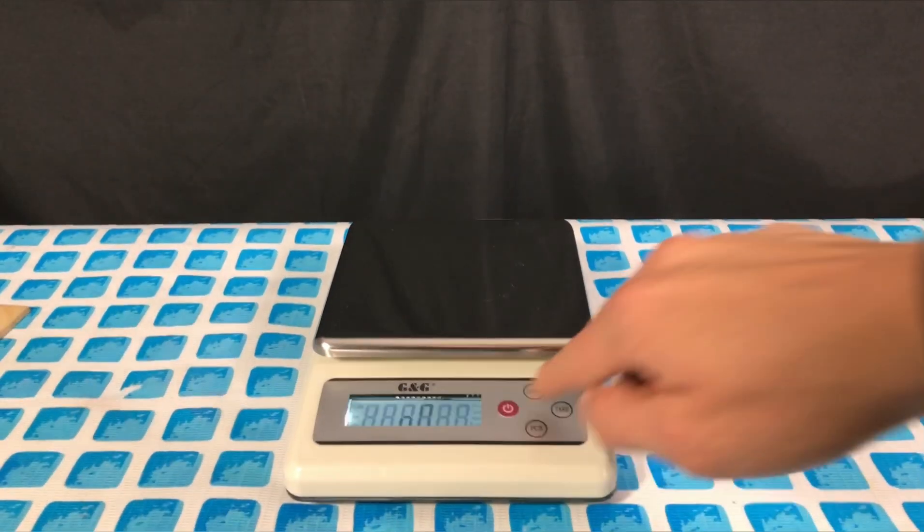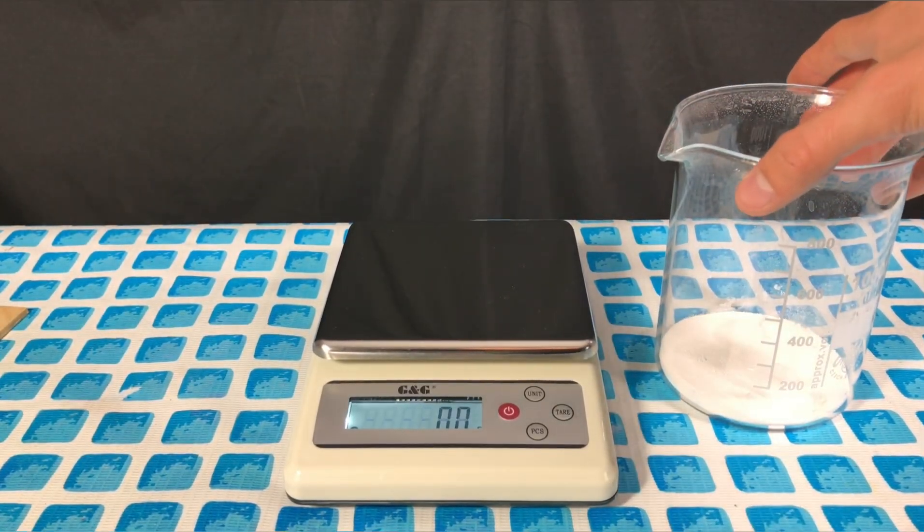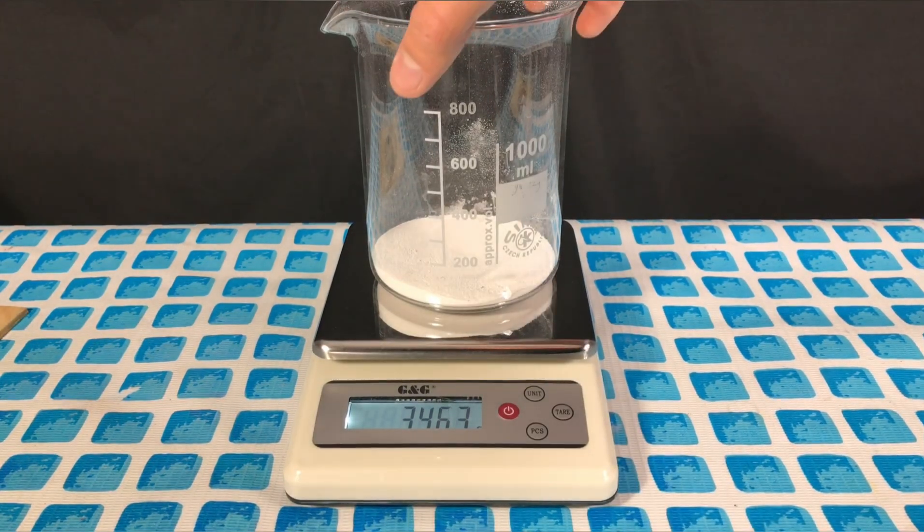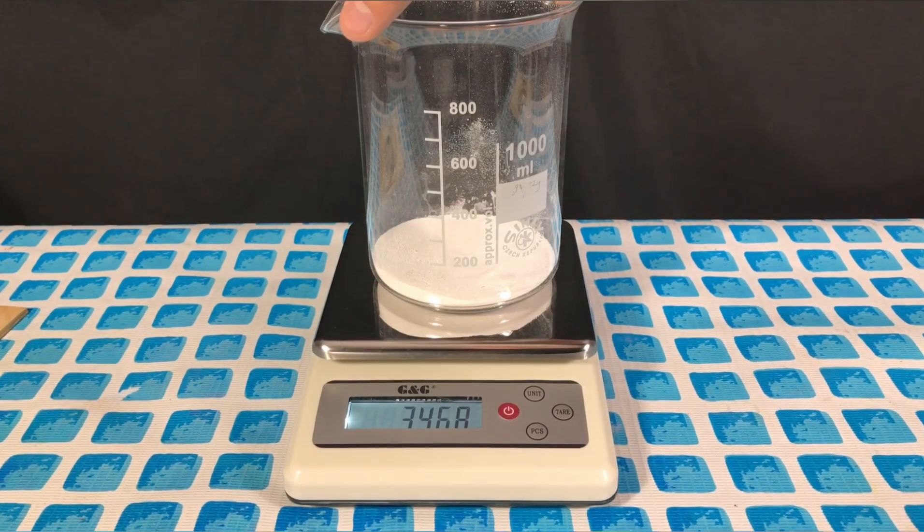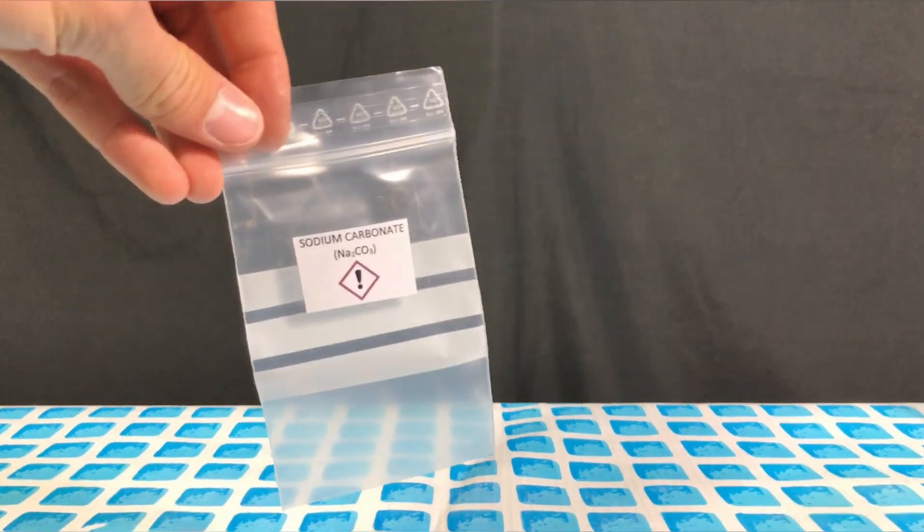To determine the yield the beaker again was put on top of a scale and weighed out. By subtracting the weight of the beaker from the total weight we were left with 53.1 grams. This represents a yield of 100.3% which means there is still some unreacted sodium bicarbonate or impurities. But these should be negligible. Near 100% yields can be expected.